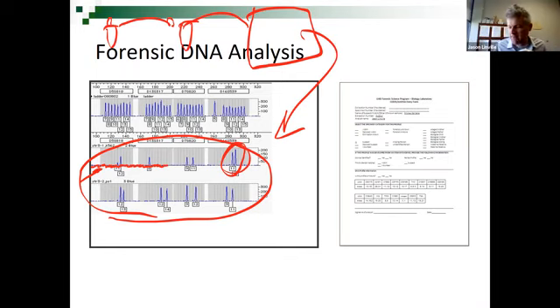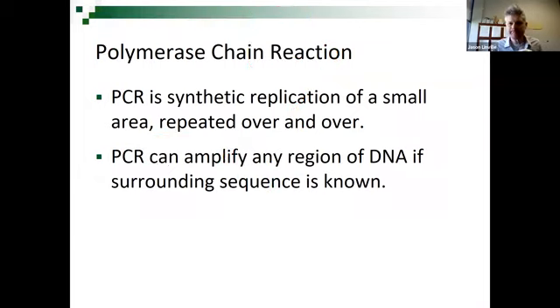So we can say, yeah, there's definitely DNA there. And that's definitely a 9 allele and an 11 allele. That's a 9, 11. There's one of our pairs of numbers there.